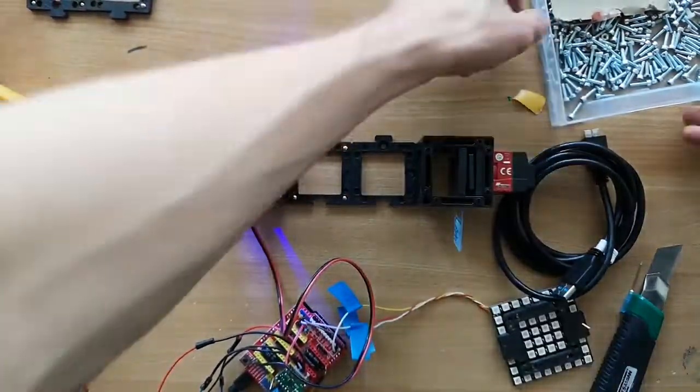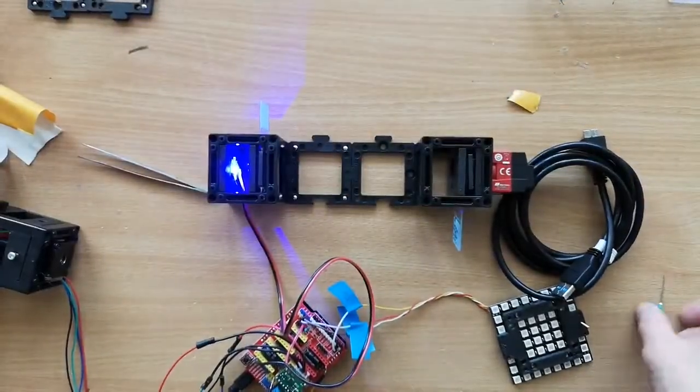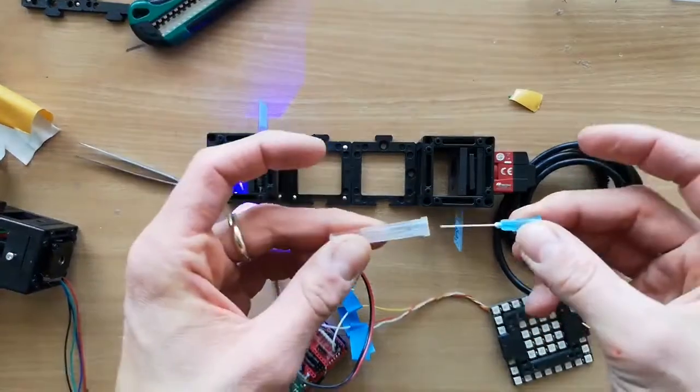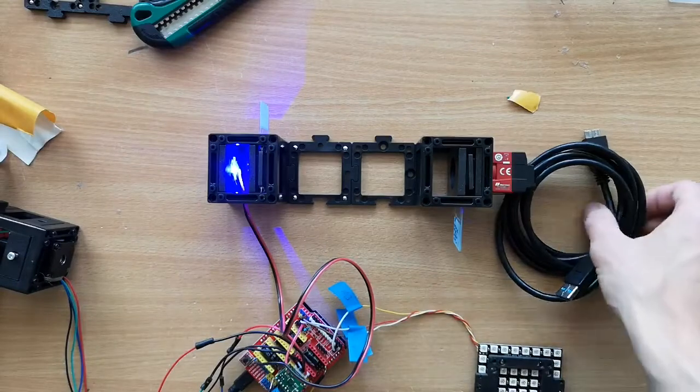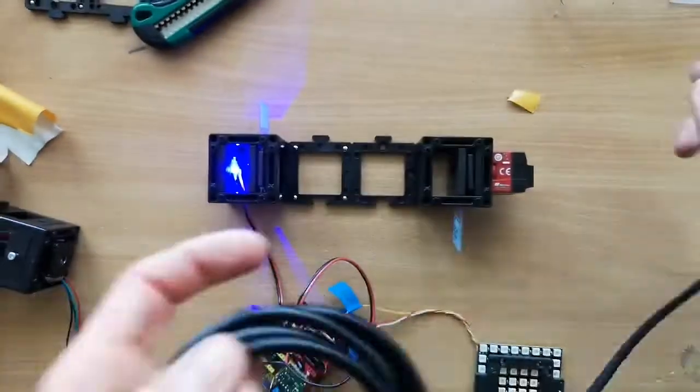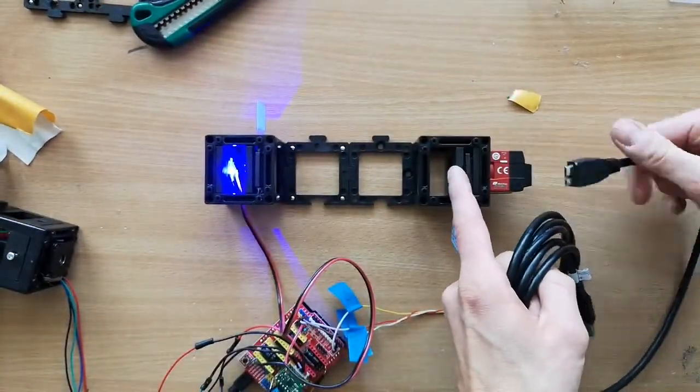Put everything together, clean up the space, and make sure you don't hurt yourself. We're done with the first setup — now we need to connect the camera and get familiar with the software.